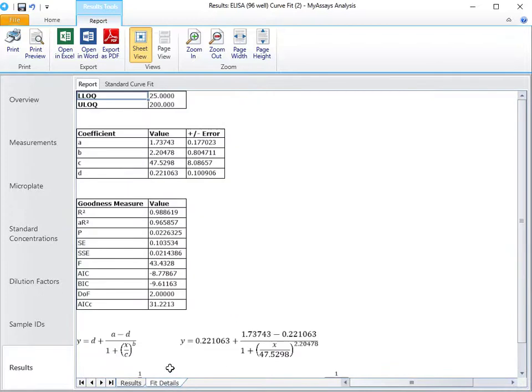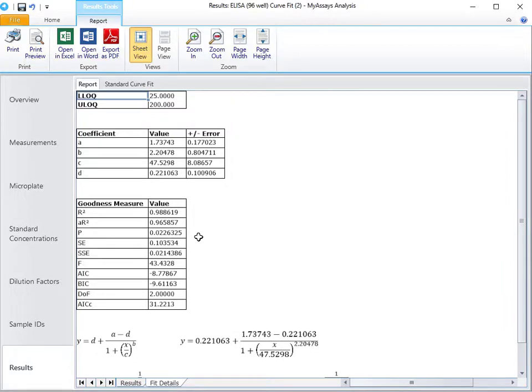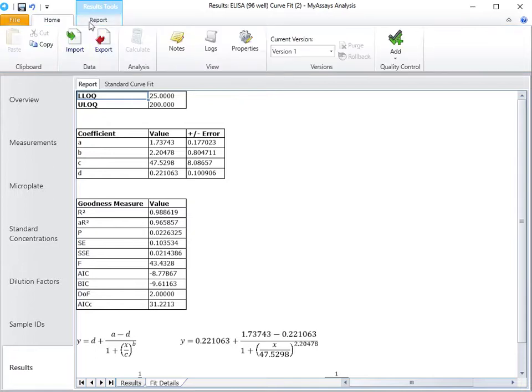On the fit details tab, you'll see additional information about curve fitting, including coefficient values and goodness measures. You can quickly export this report using these pre-configured options, or use the export wizard to export in a different format, perhaps suitable for your LIMS.